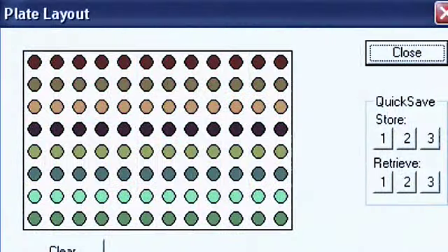The bio-calculator software is an integral part of the KayakCell system. The interactive tools simplify analysis and allow for quick data interpretation.